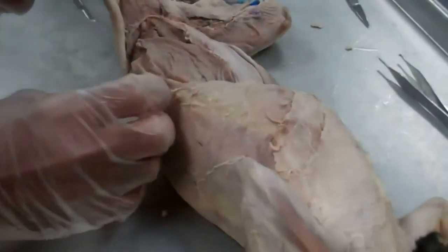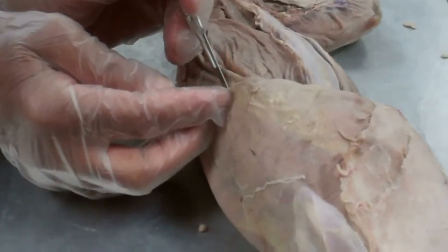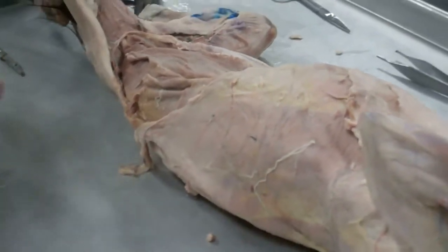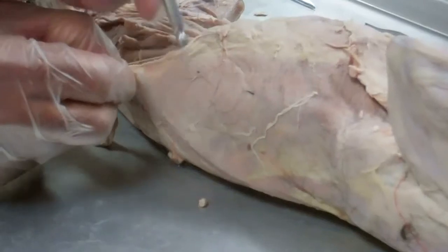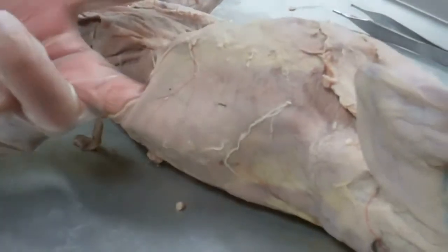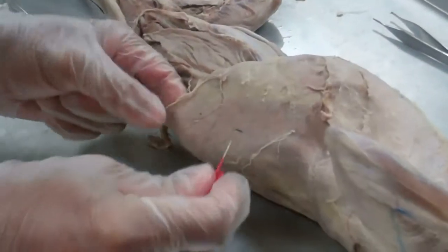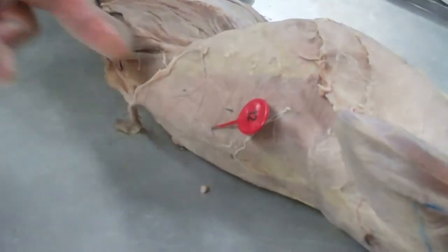Latissimus dorsi. Okay, next we're going to be doing the latissimus dorsi. So we're going to cut along the fascia line. And we'll use our probe to clear out the other fascia. This muscle right here, number 12, it's the latissimus dorsi.